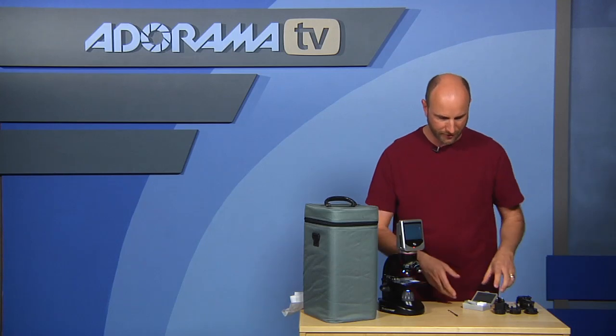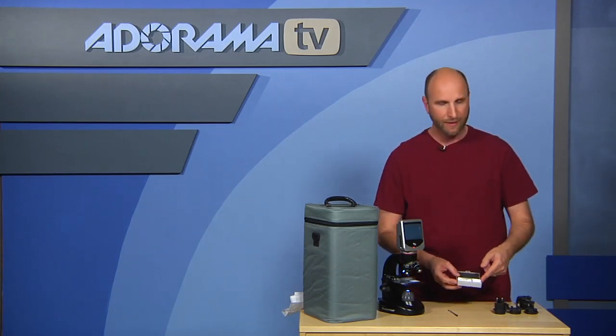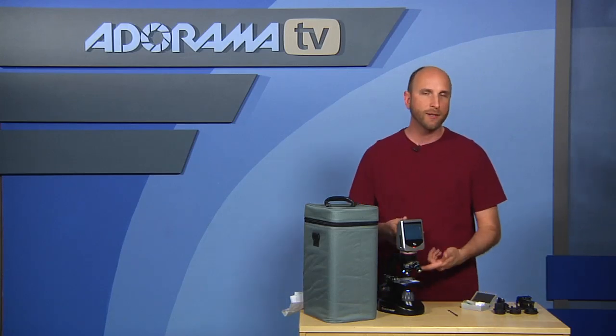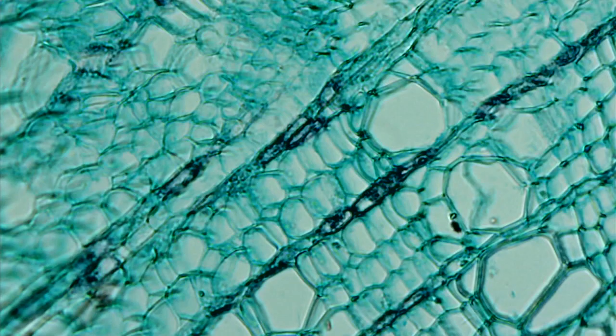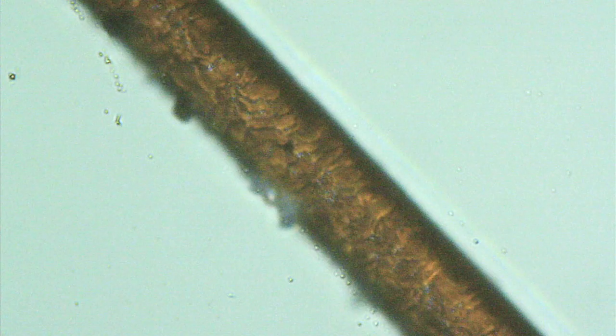We've used all these slides — they have a bunch of prepared slides, things like a sliced apple, epidermis, some skin, and wood pine, which is in here right now. I took a bunch of shots and we're going to show you those. These shots are the actual images taken with this microscope, and it's really simple to do. Not only can you take still photos, but you can also take video. The video is not nearly as high resolution, but it works pretty well and it's an awesome teaching tool.